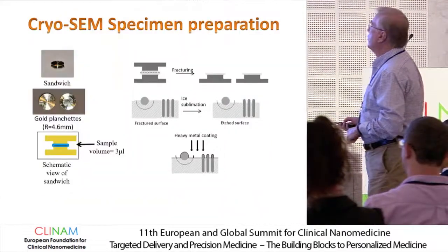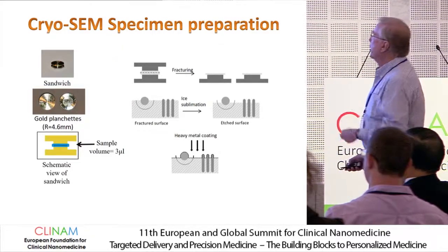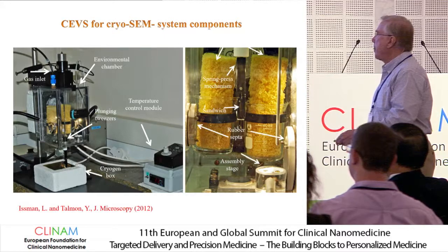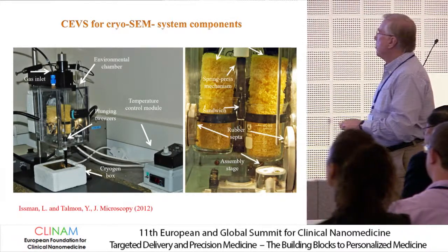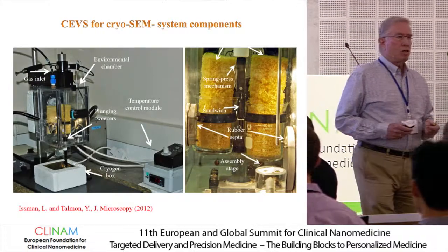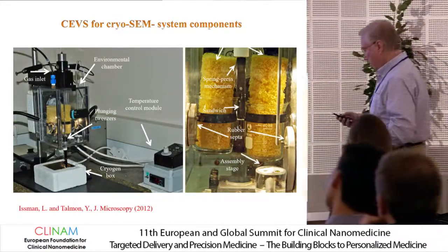Again, we have invested quite a bit of work into the specimen preparation, which I will not describe here, but here you have just a schematic to remind you that there is something behind it. And this rather complicated slide, which is taken from a 2012 paper with my former student Leon Isman, shows you that we have a system that allows us to prepare cryo-SEM specimens at controlled conditions, which is really very, very important.